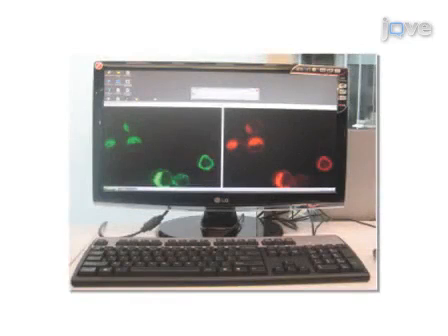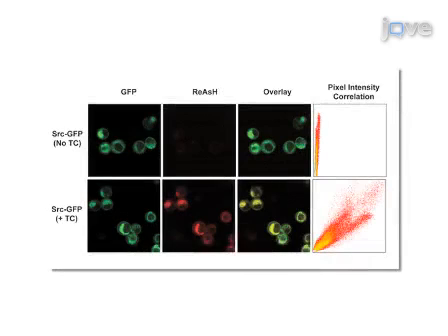Finally, the images are analysed using ImageJ to quantify binding of ReAsH or FlAsH to the target protein. Ultimately, results can be obtained that show the extent of ReAsH or FlAsH binding to the target protein in cells through the correlation of ReAsH fluorescence with fluorescent protein fluorescence.